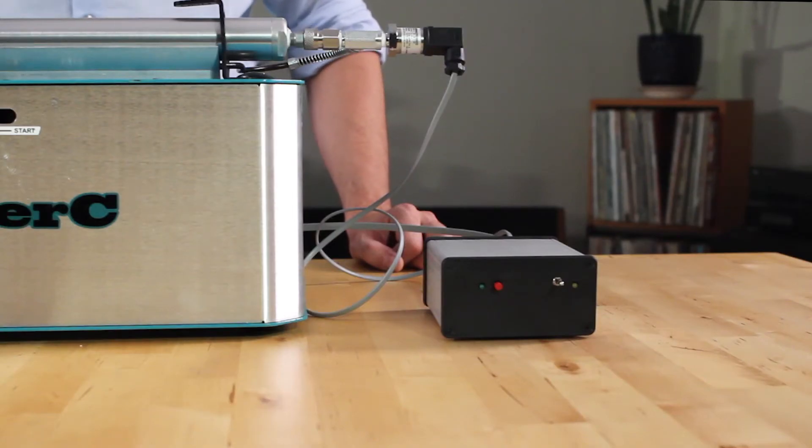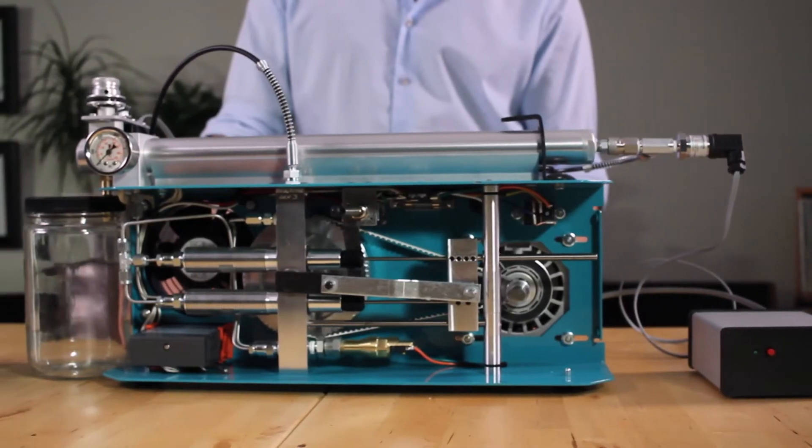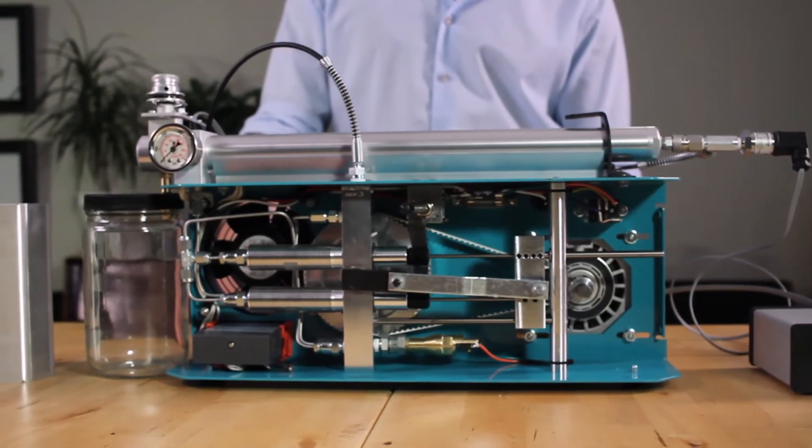The Super C now includes the Autopilot as a standard feature for every unit. It is equipped with an industry standard burst disc, as well as a pressure shutoff switch to prevent any over-pressurization.